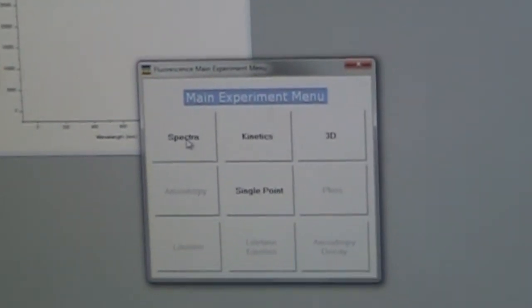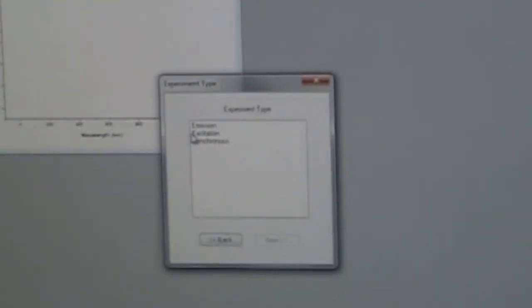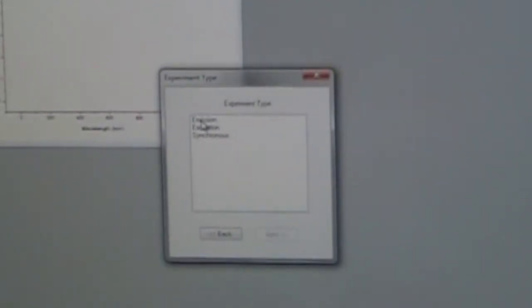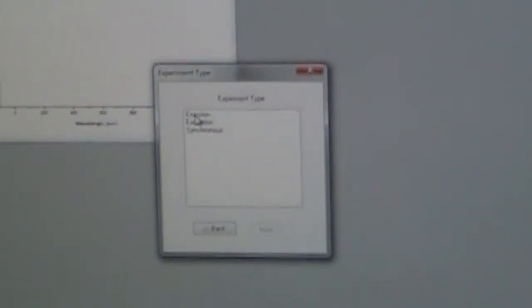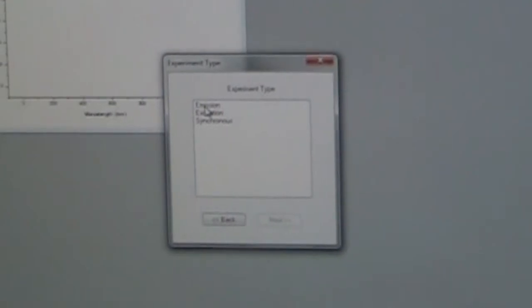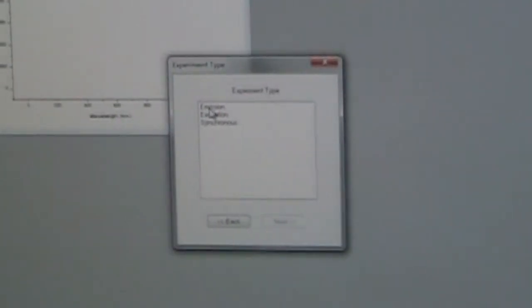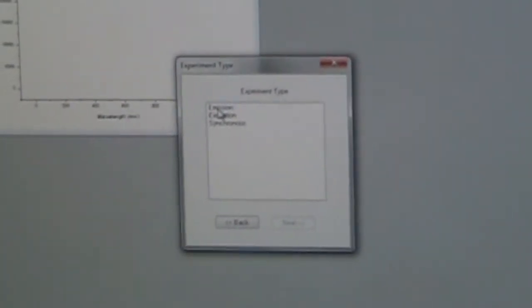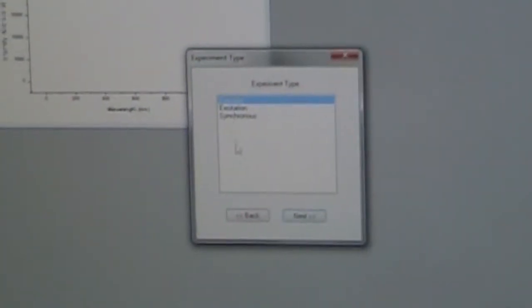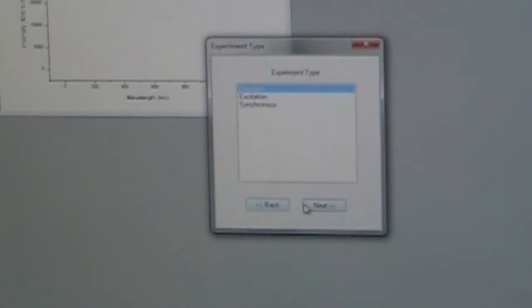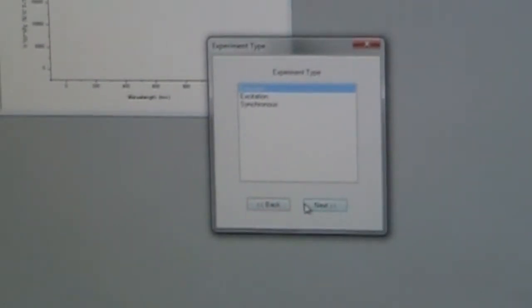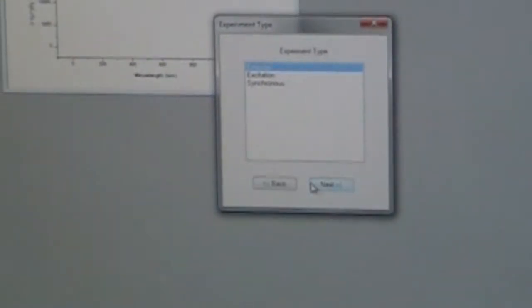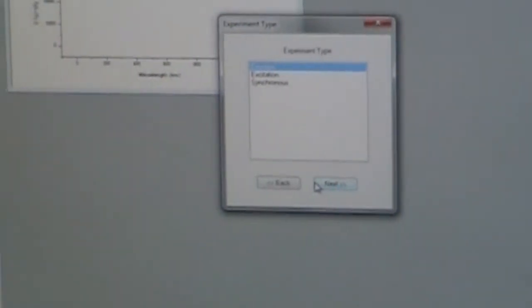And we are going to do an emission experiment. We're going to excite the sample and then we're going to study its emission. So we're going to go to emission experiment type. Next.